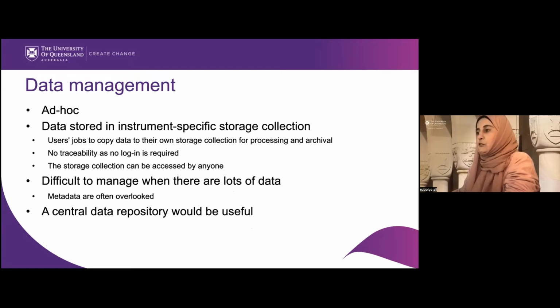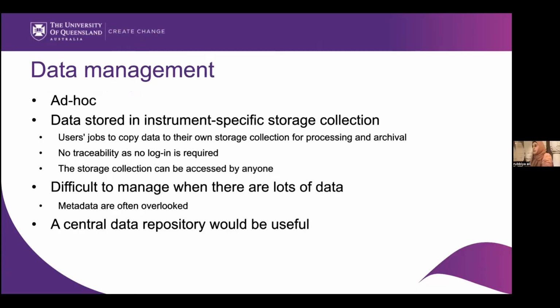Some instrument managers were syncing data every fortnight and cleaning up the local data storage regularly, while others looked after these aspects only every year. So it was a struggle to find out these details centrally.